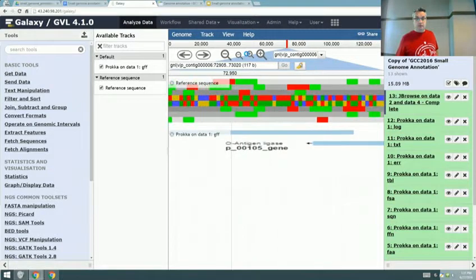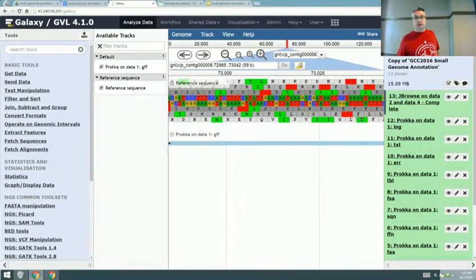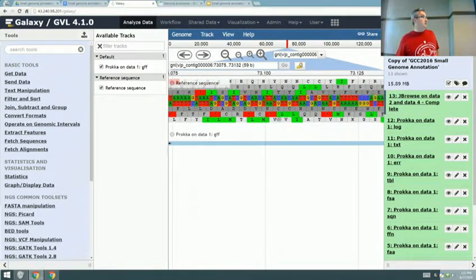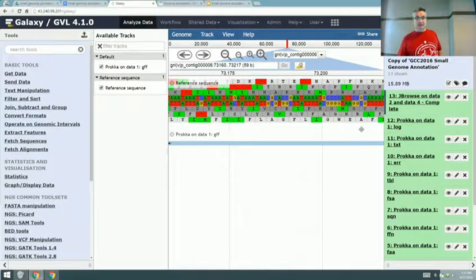So the proteins are down here, but you don't know which reading frame they're in. It'd be great if it did a rectangle around the reading frame. Well, you can see this is the stop codon, so it's probably in this bottom one here. Probably. You can visually see it? Yeah, you can have it color the transcripts by the frame. Oh, cool.